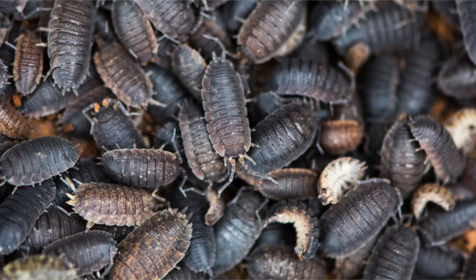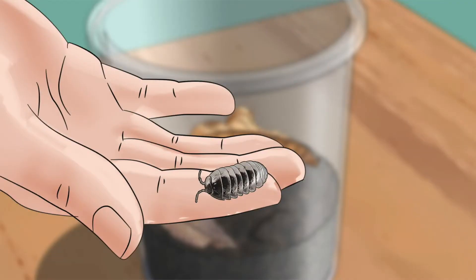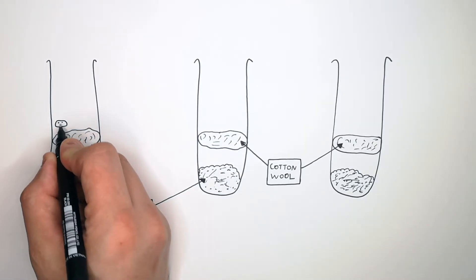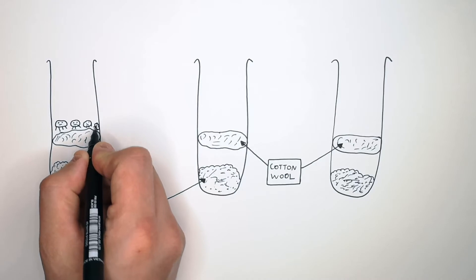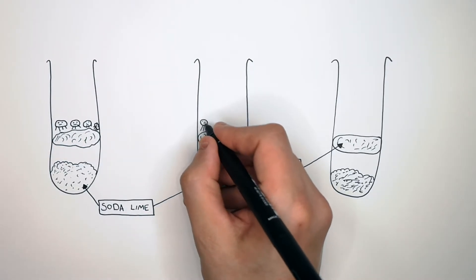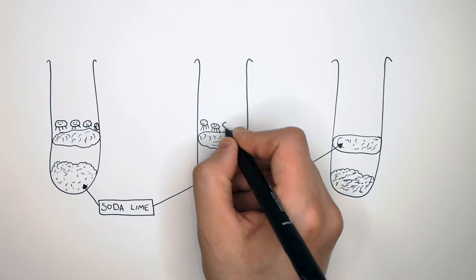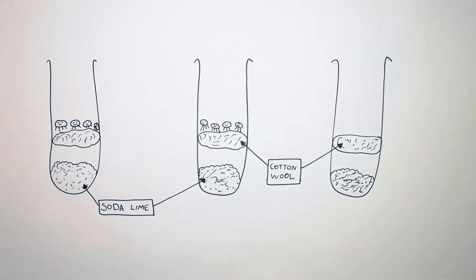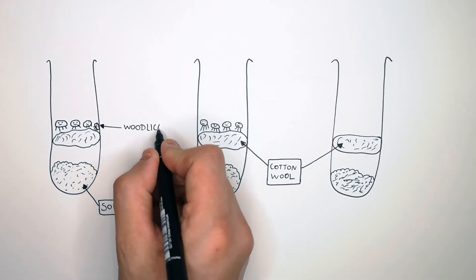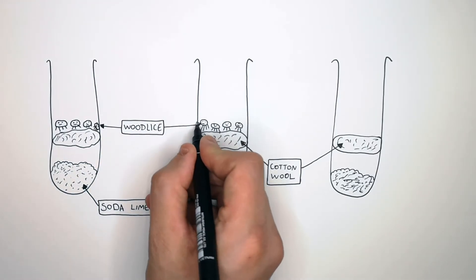You're now going to handle wood lice. These are living creatures. You must only take them out of the box where they are stored when you are putting them in the test tube; otherwise, they must be handled very carefully. The tube on the left and the tube in the middle are where we're going to put the wood lice. You must put the same number of wood lice in each test tube — this is a control variable.